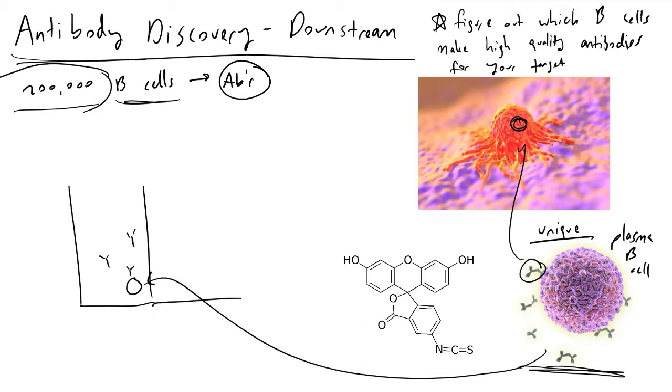And we have tons of these pens all next to each other with other B cells that are producing slightly different antibodies. I'll just draw this in so it makes some sense here. These antibodies being secreted by your plasma B cell will also have an affinity perhaps for your tumor cell. So if you could figure out a way to get enough tumor cells, or if you could load the surface receptors onto a bead, you can have your tumor cell present in this.